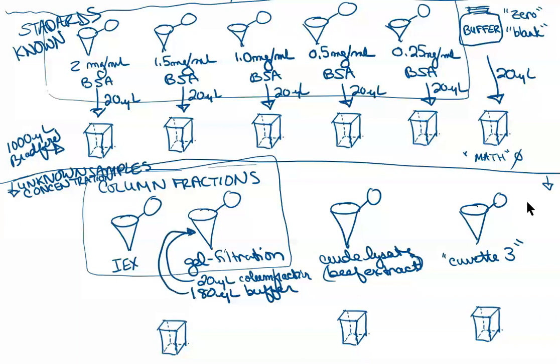The ion exchange samples were much more dilute. And so we had, I believe I asked you, 60 microliters of the column fraction and 140 microliters of buffer. So put both of these items in here. So we had combined those two things, right, depending on your column that you ran. Please refer to the exact dilution on your lab protocol to make sure that my memory is correct. But this dilution factor is important, and we're going to come back to it in a little bit.